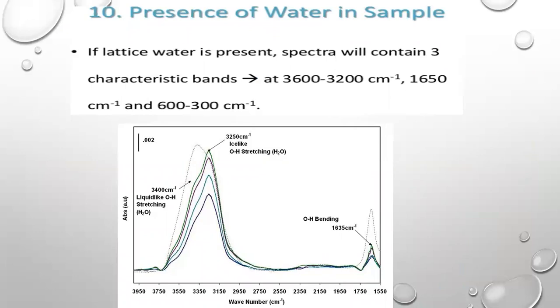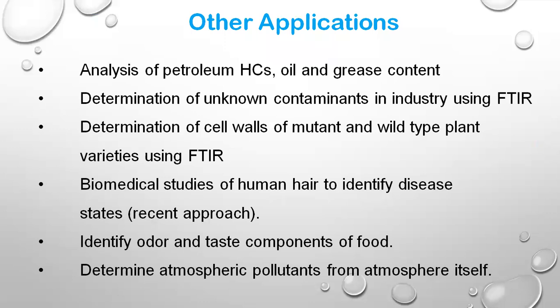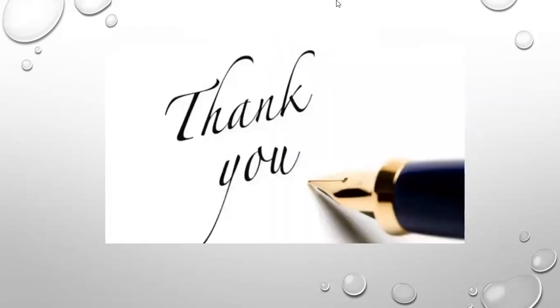IR is very susceptible to the detection of water in the molecule. If OH stretching is present in the molecule, that means the molecule has some amount of moisture. These are more applications of IR spectroscopy. Thank you. This was all about the instrumentation and applications of IR spectroscopy.